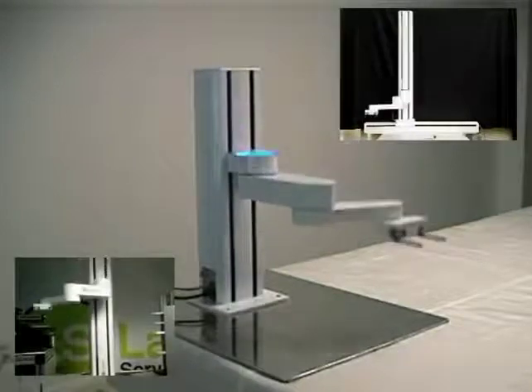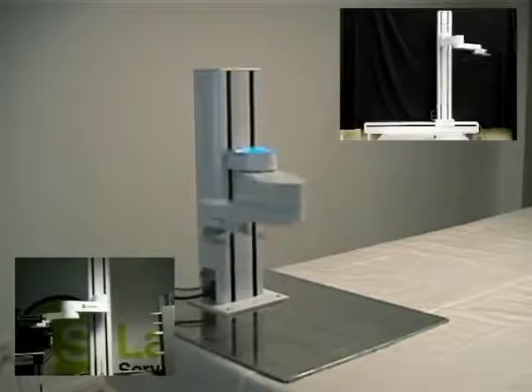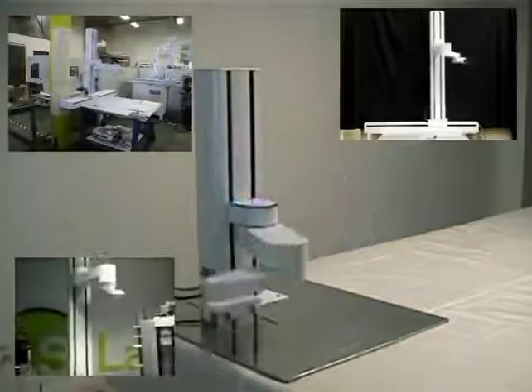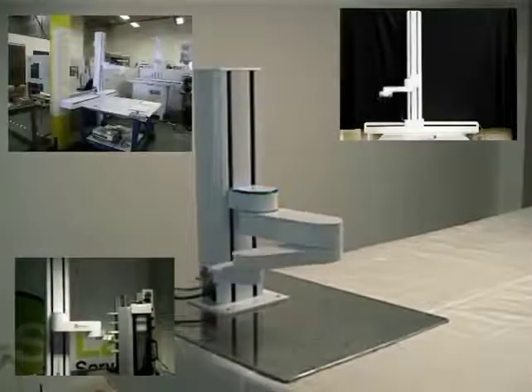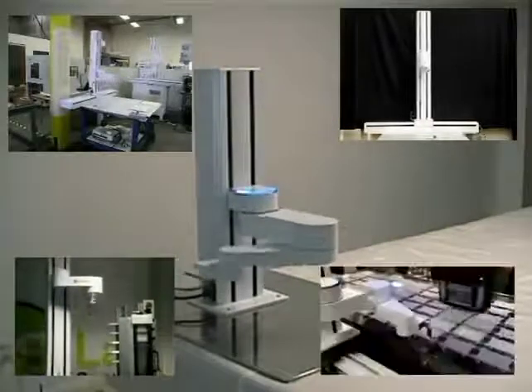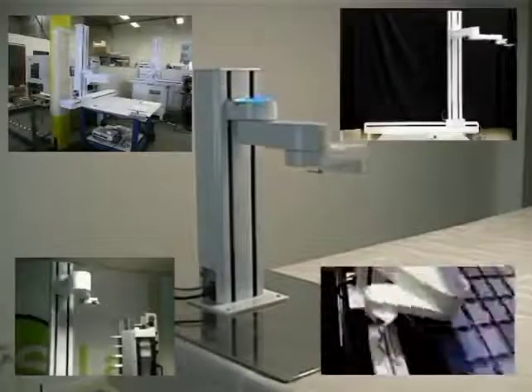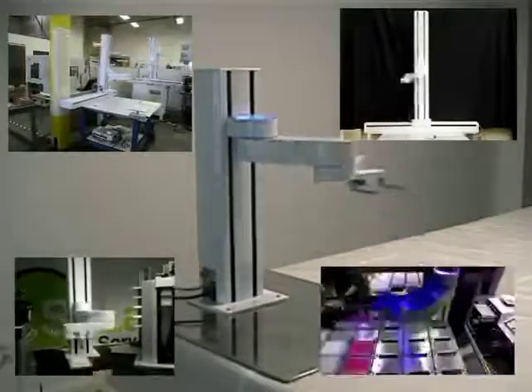This revolutionary combination of safety, capabilities, and performance allows the PF400 to be used in environments where automation could never go before — working side-by-side with human counterparts on assembly lines, on desktops of analytical labs, and soon in clinical diagnostic environments. In fact, after careful review, hundreds of PF400s are in daily use in desktop applications without safety barriers.